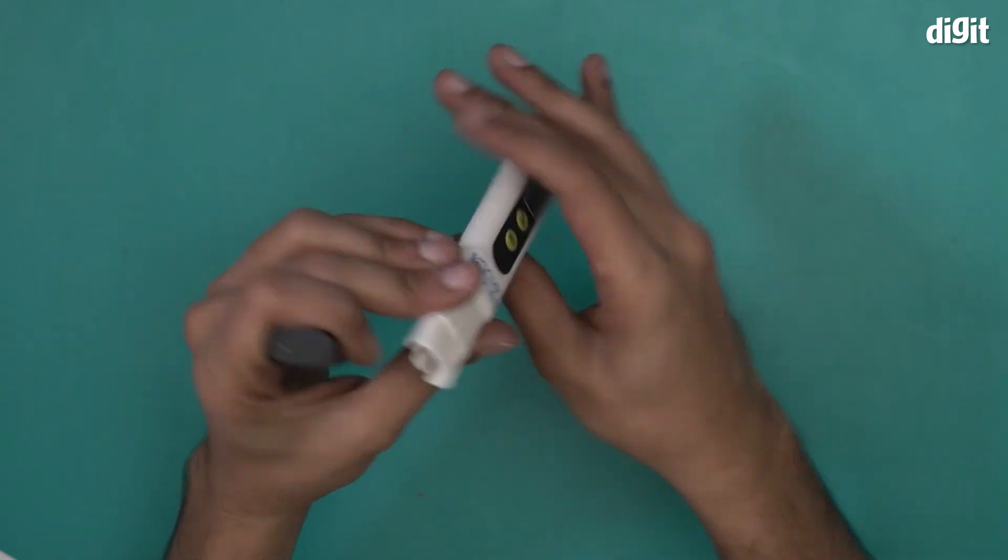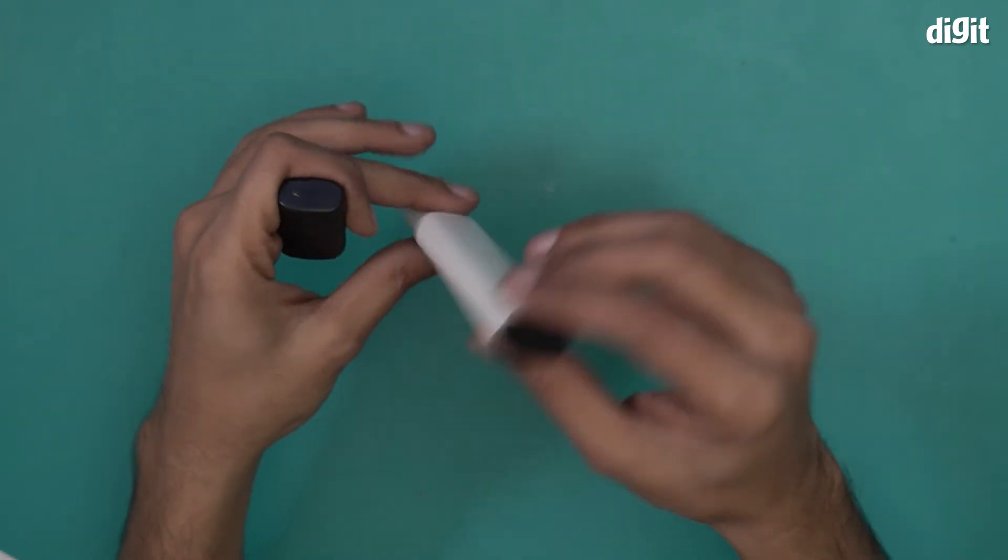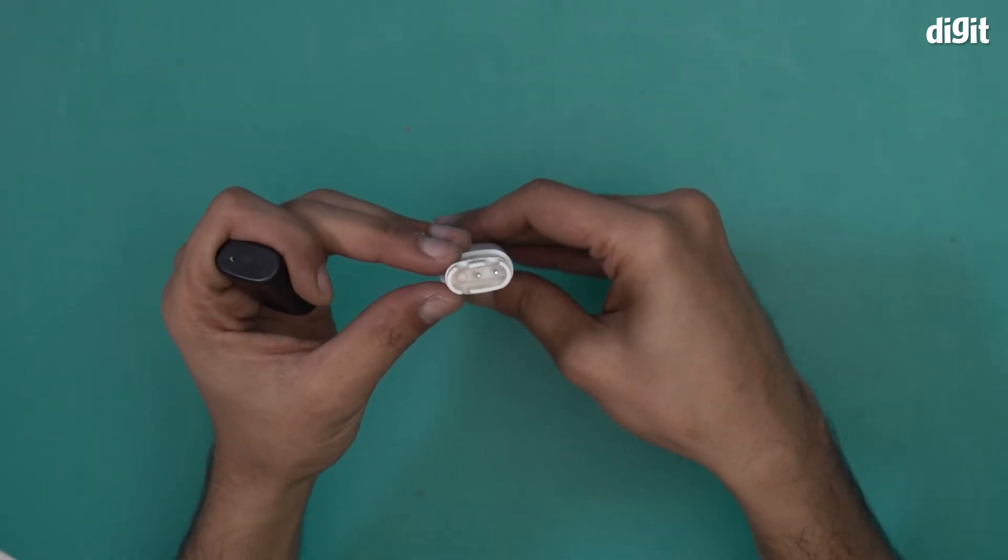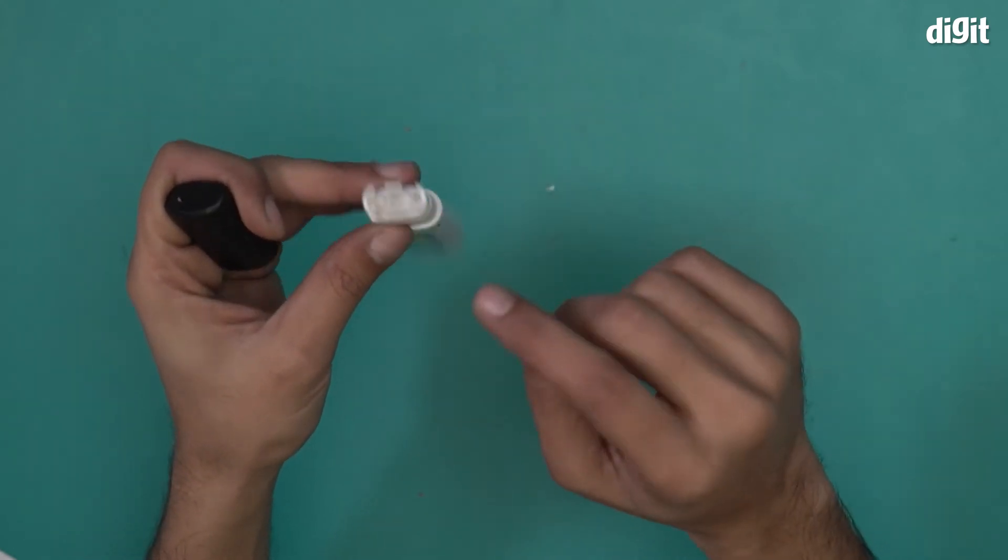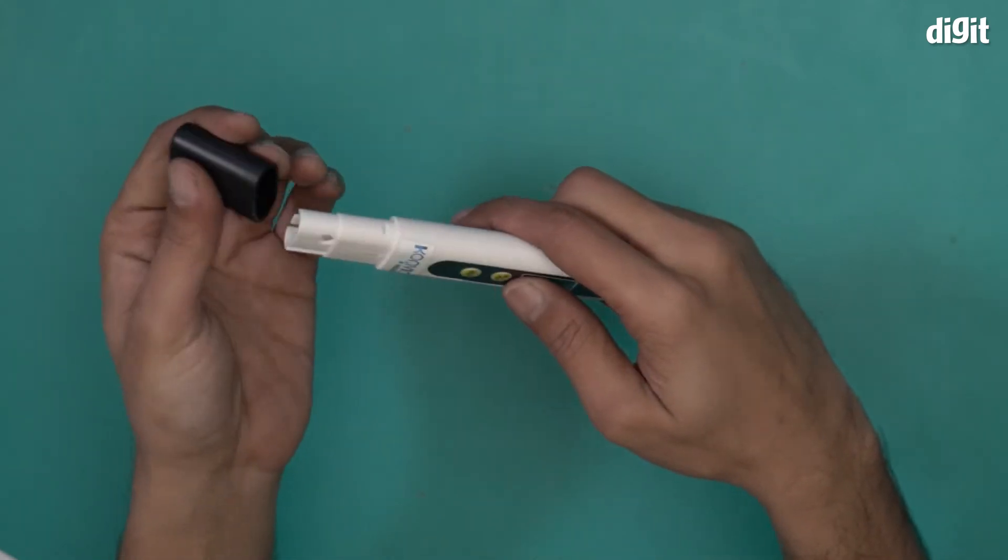Let's open this part. And yeah, there you go. This is what it looks like. This is the part that will be immersed in water in order for this device to take accurate reading.